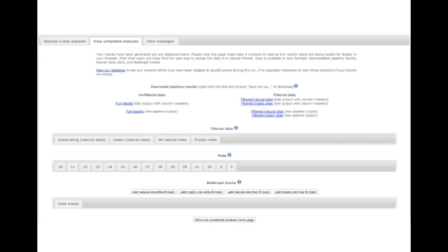The format can be used as input for our companion software Veridical, which examines BAM files to determine if evidence is present for the predictions made by the Shannon pipeline. Either filtered or unfiltered output can be downloaded. Unfiltered output will be unaffected by any filters you selected before the run, while filtered output will take them into account. To download any of the files, simply right-click on the link to the appropriate file and choose Save Link As, or the equivalent in your browser.